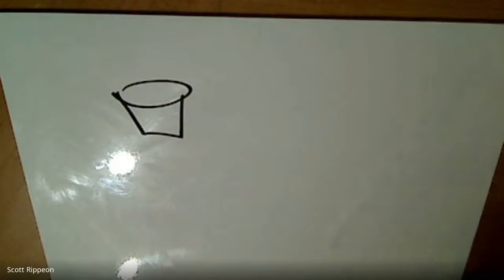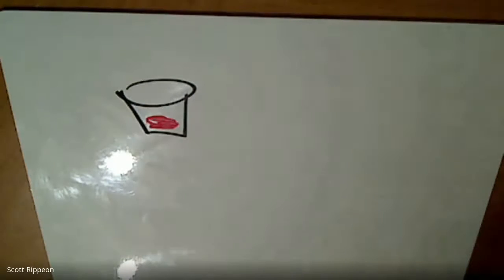Okay, so the labs. There's two basic labs that are going to be occurring. The first lab we did was 6.6. What we did in that lab is we just took some copper and we heated the heck out of it. All right, so we gave it a lot of heat.